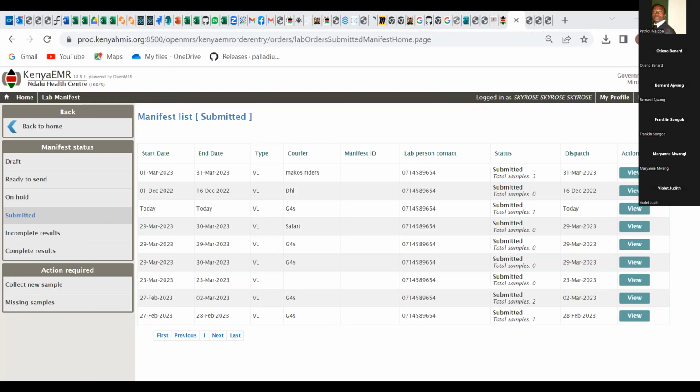So I don't want to go through all of them because clearly I've seen that all of them have been responded to. There was a question from Patrick. I don't know if it has been responded to, about the error that he's been receiving, and I think that was like the second or the third question I've seen about service providers receiving error messages.